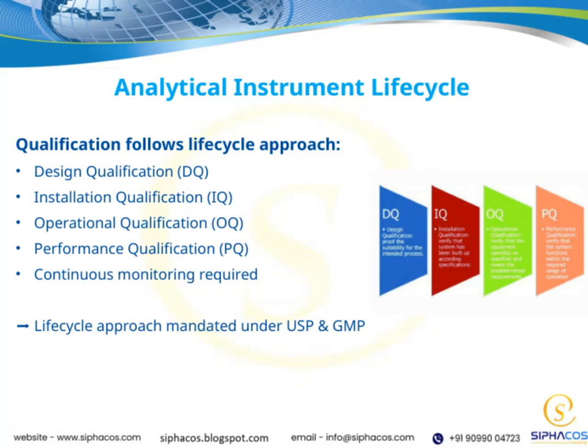Let's take a closer look at the analytical instrument lifecycle. As you can see, qualification follows a life cycle approach, which is essential for ensuring consistent performance and compliance. This life cycle includes several key stages: design qualification, or DQ, where we verify that the instrument design meets our requirements.